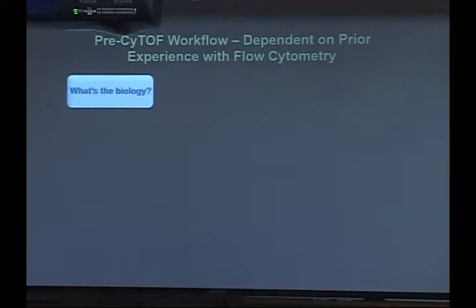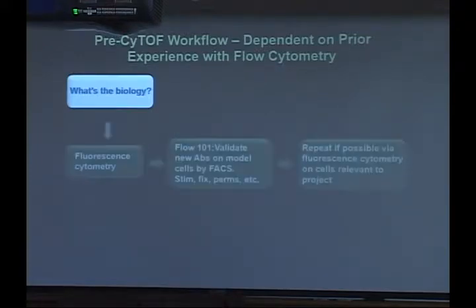So, as I mentioned before, what's the biology? It really is good to know that, and be surprised how many people have asked to do an experiment, but they actually haven't thought of the question they would like to ask. And so we have a Flow 101, which I think Sean was nixing out, but I'm going to actually put it back in another slide.